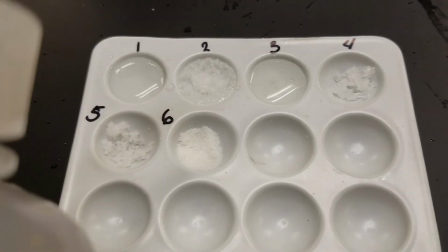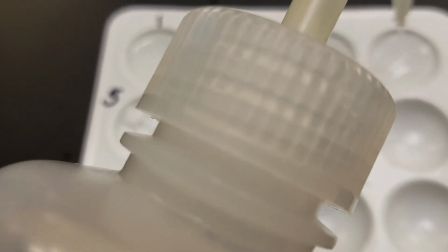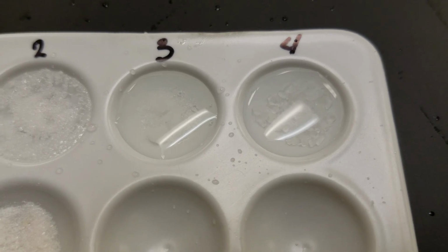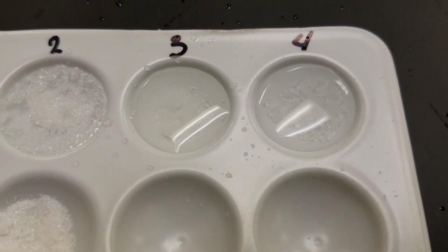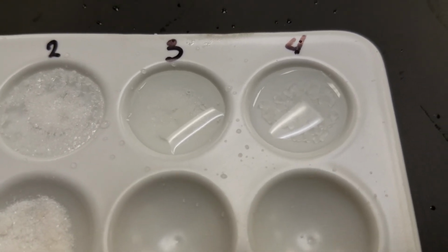Number 4, that's sucrose, regular sugar. And I don't see any dissolving for number 4. Again, it's just sitting there. Maybe over time it will dissolve, but just as it is, I'm not seeing any change.